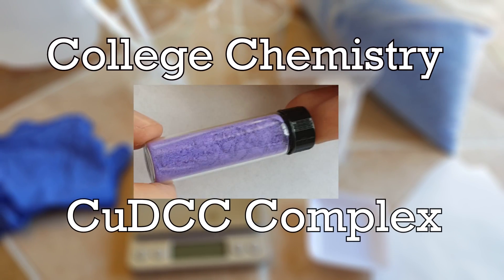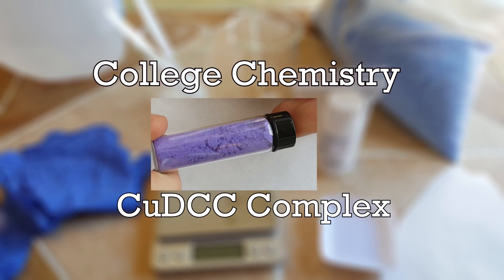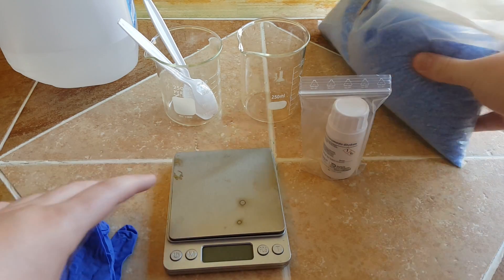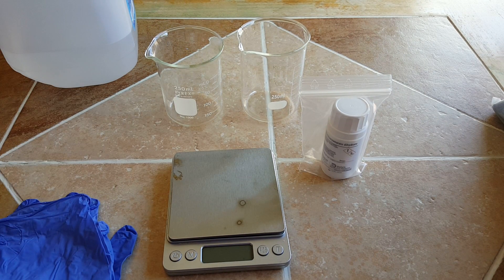One talks about the wonders of modern science, but seldom thinks of the simple things scientists are doing. In this demonstration of practical chemistry — hi everyone. In this video I will show you how to make a beautiful copper complex. This is a pink one, which is fairly uncommon when talking about copper complexes.